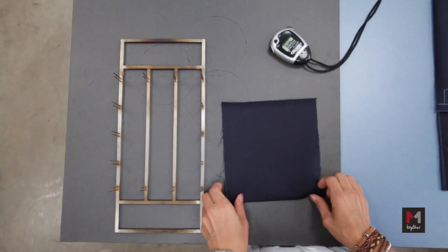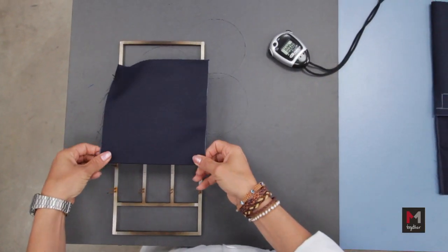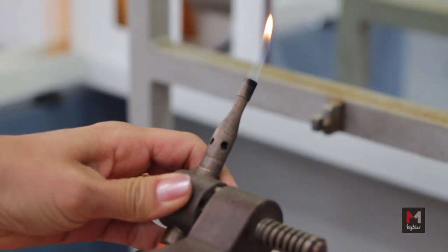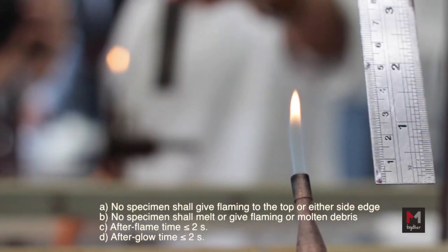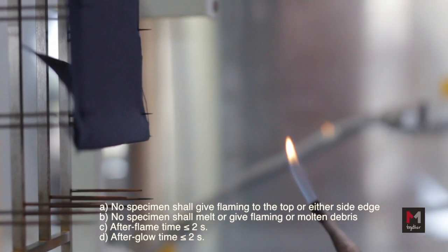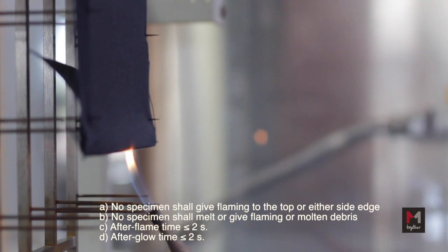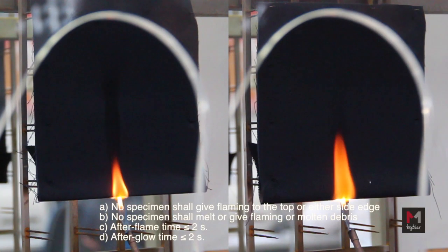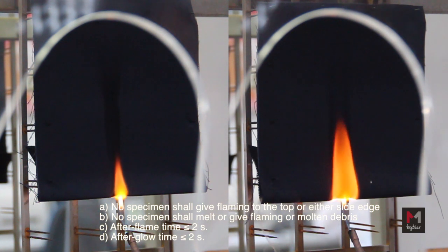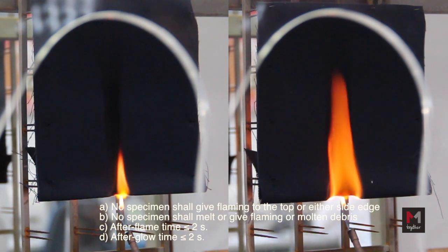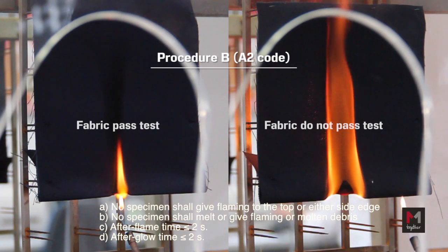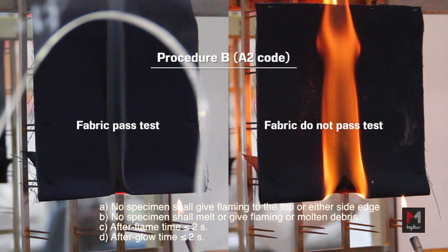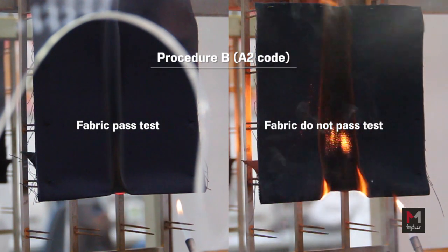When tested according to Procedure B, the flame is applied at a 30 degree angle to the fabric. It shall meet the following requirements: No specimen shall flame at the top or on either side. No specimen shall melt or have flaming or molten debris. The mean value of after-flame time shall be less than or equal to 2 seconds. The mean value of afterglow time shall be less than or equal to 2 seconds.